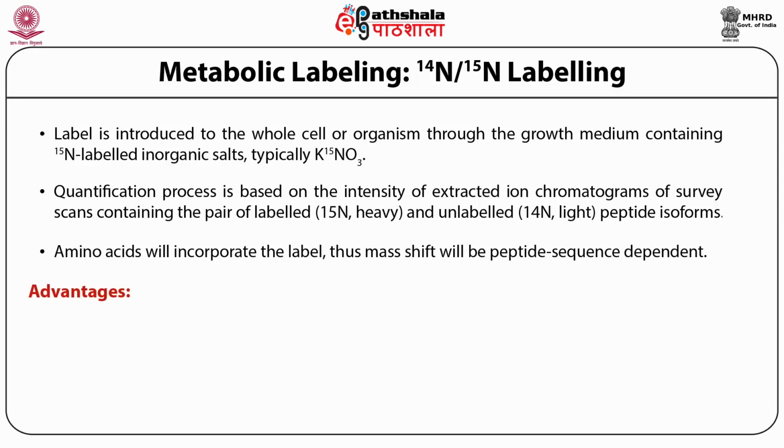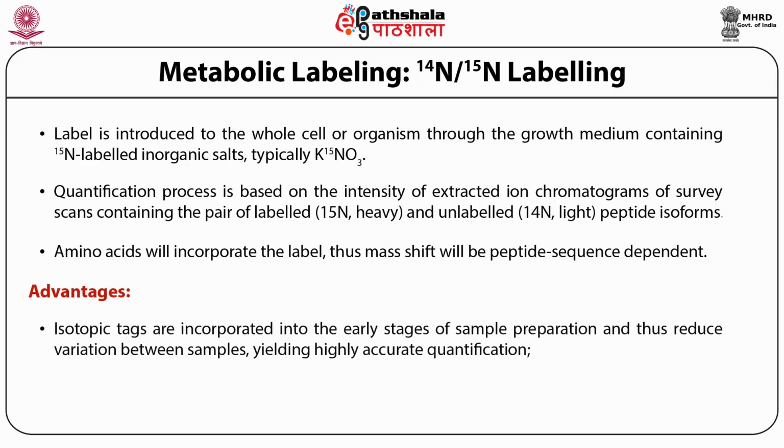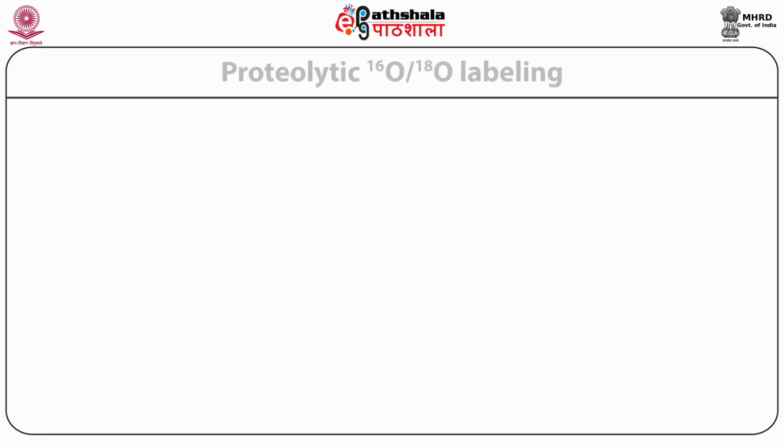The advantages are the isotopic tags are incorporated into the early stages of the sample preparation and thus reduce variation between samples, yielding highly accurate quantification, and also this allows large-scale quantitative analysis.